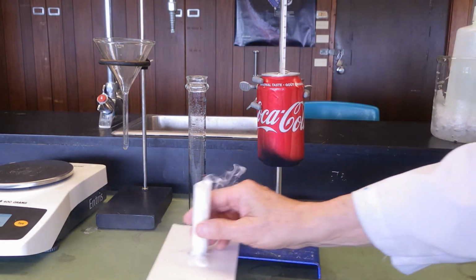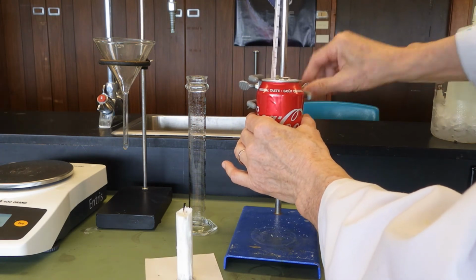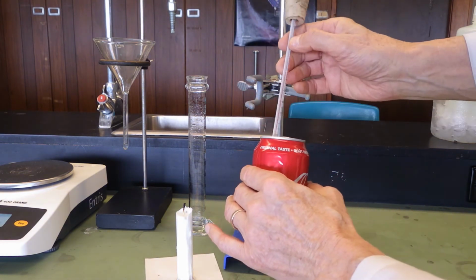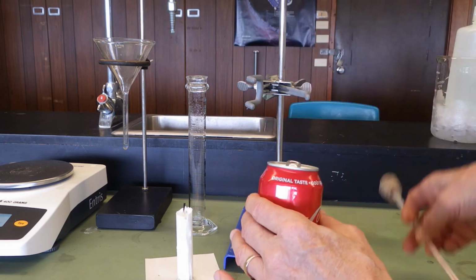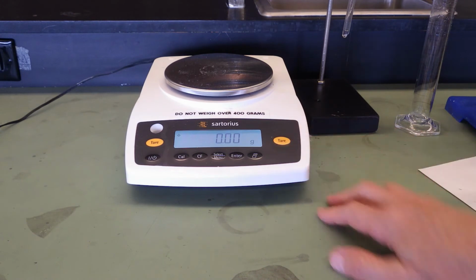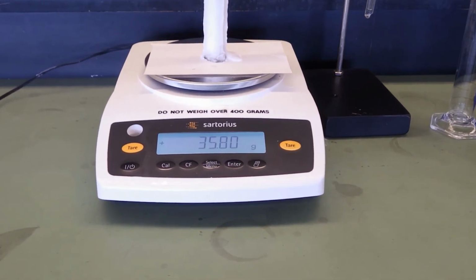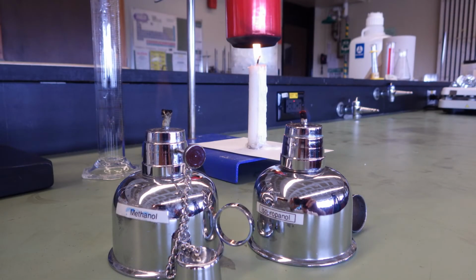All right, we've reached a high temperature. Looks like 58.0 degrees Celsius. Look at the large amount of unburned carbon, or soot, on the bottom of that can. All right, let's get our final mass of the candle: 35.80 grams. So I think we have everything we need to do the calculations. Let's go back to the procedure and see how that is done.